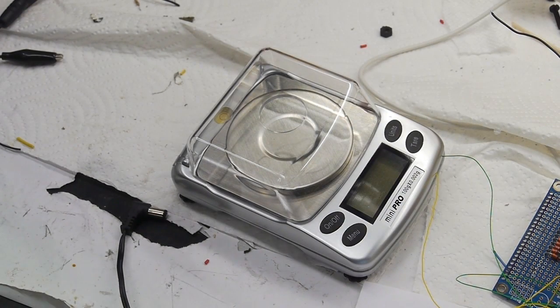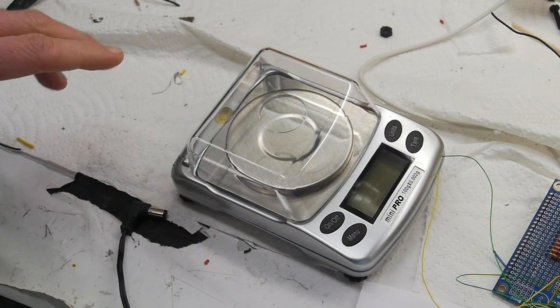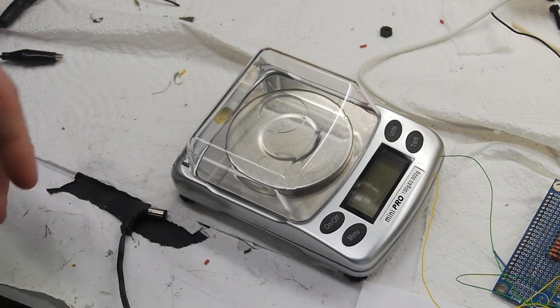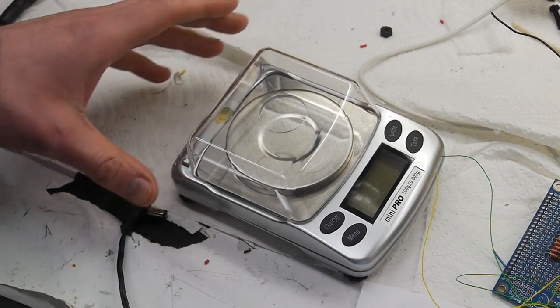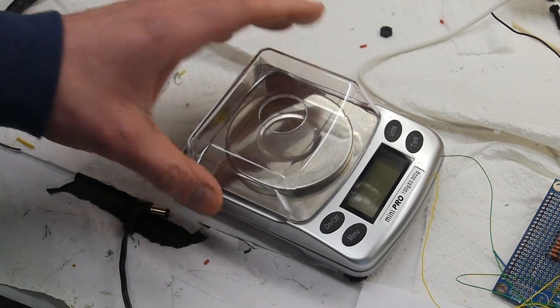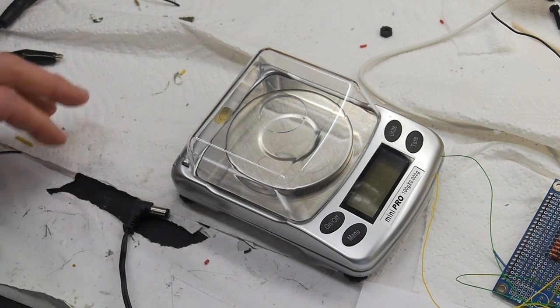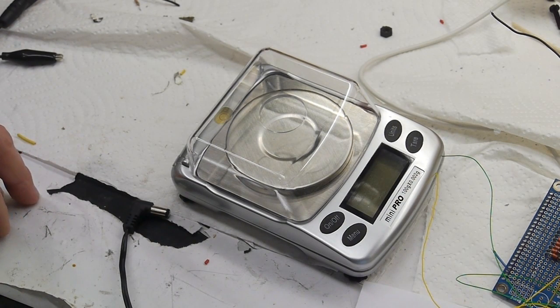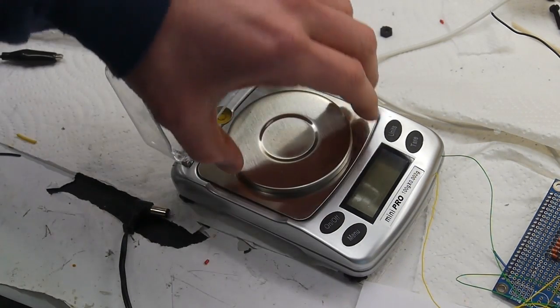For my current project I'd like to use a microcontroller to dispense a material onto a balance, and then have the microcontroller stop the dispensing when it's weighed out a certain amount. This scale doesn't have any electronic interface, so today's task was to crack it open and figure out a way to get a microcontroller to read the values from the balance. Later I'll do a video showing how I'm going to meter out the material and turn off the dispensing when we get up to a specified mass.